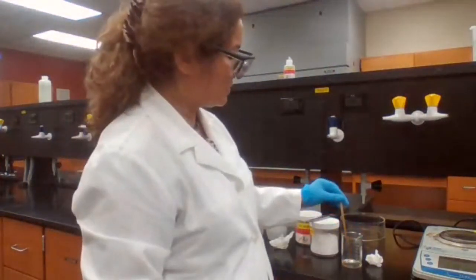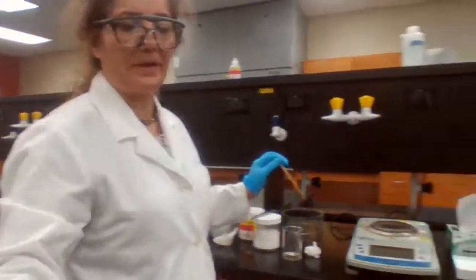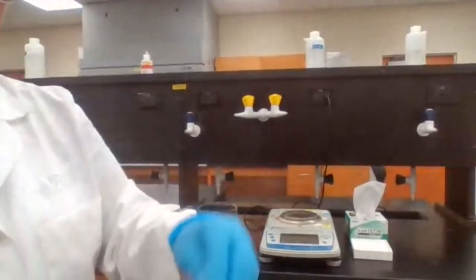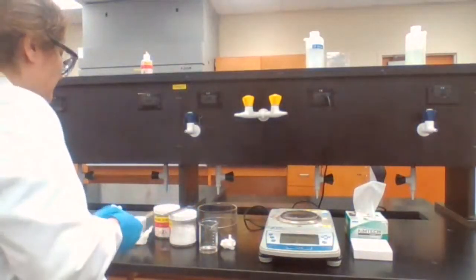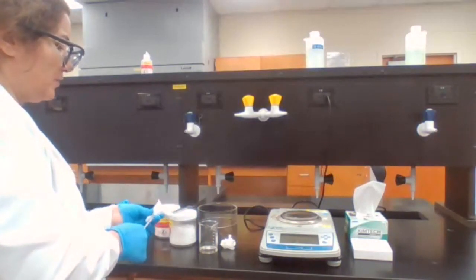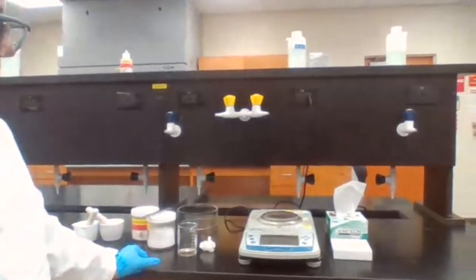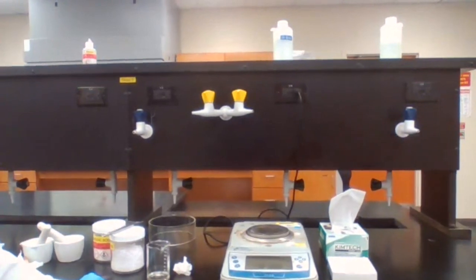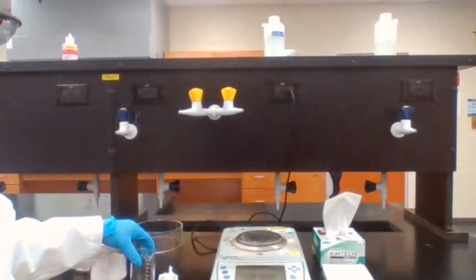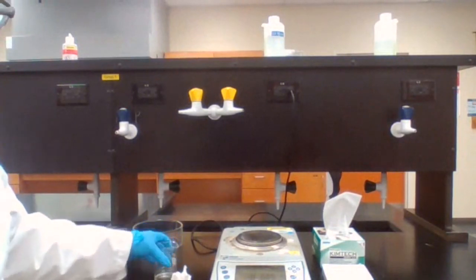We are going to leave it to cool down slightly because you don't want to measure the mass for hot objects. We let it cool down and we measure the mass. With the mass of the product, you can calculate percent recovery. You have the mass of the beaker already, and this is going to give you the mass of the beaker plus the product. It's still too hot.